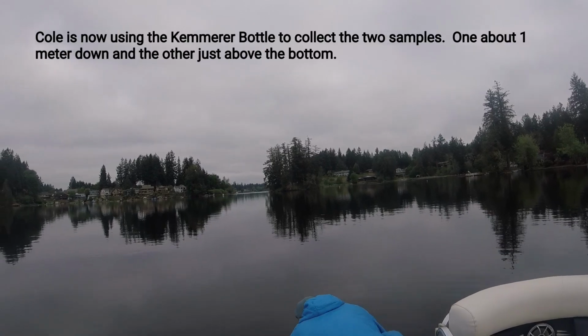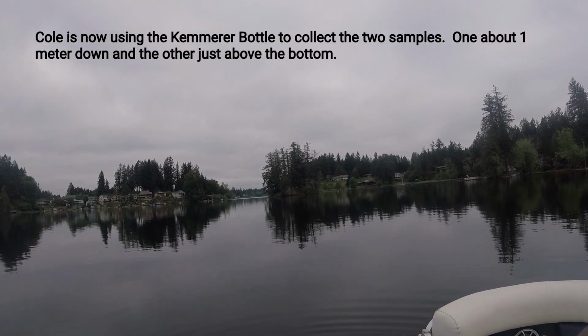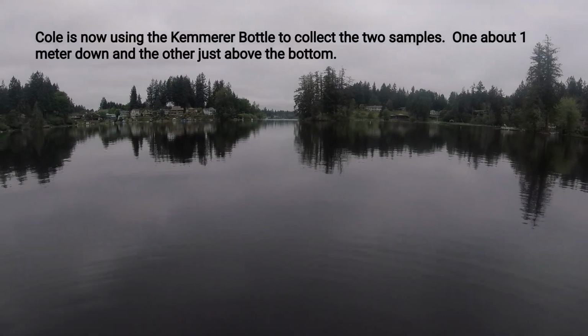So how deep are we taking this one? This one we're going to try to get right off the bottom, without trying to disturb the bottom, because there's a lot of phosphorus in there.